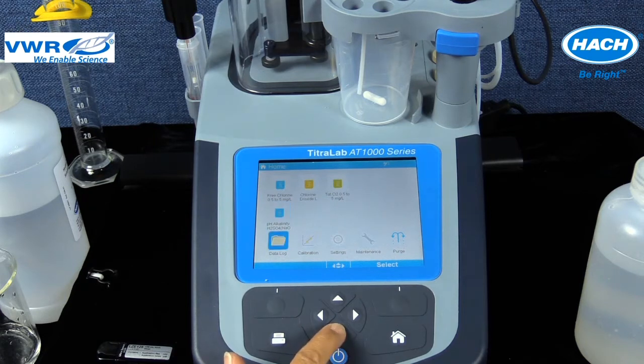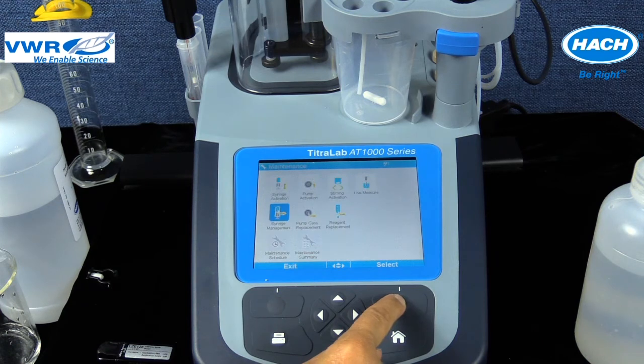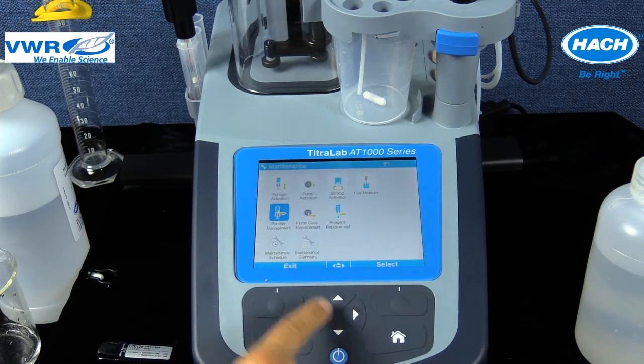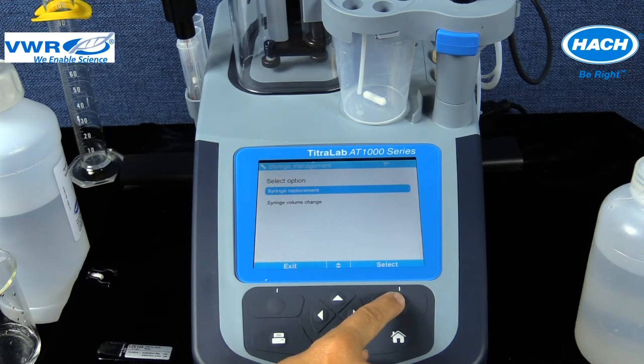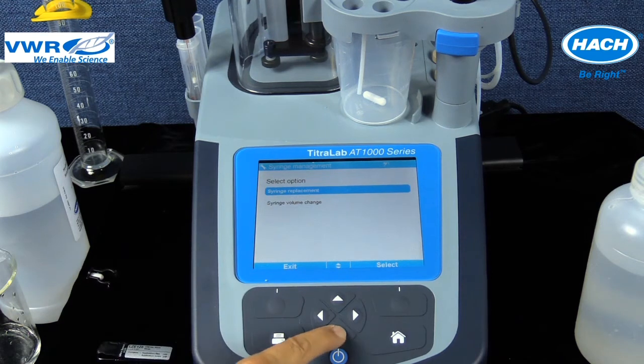Select the maintenance icon, then syringe management, then the syringe volume change for the correct syringe port in use, in this case position 2, and then select the correct syringe volume desired from the list available.